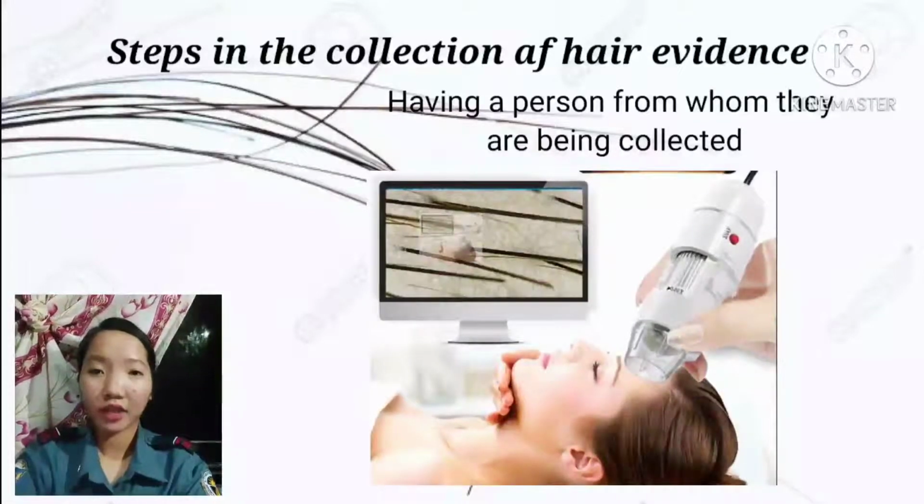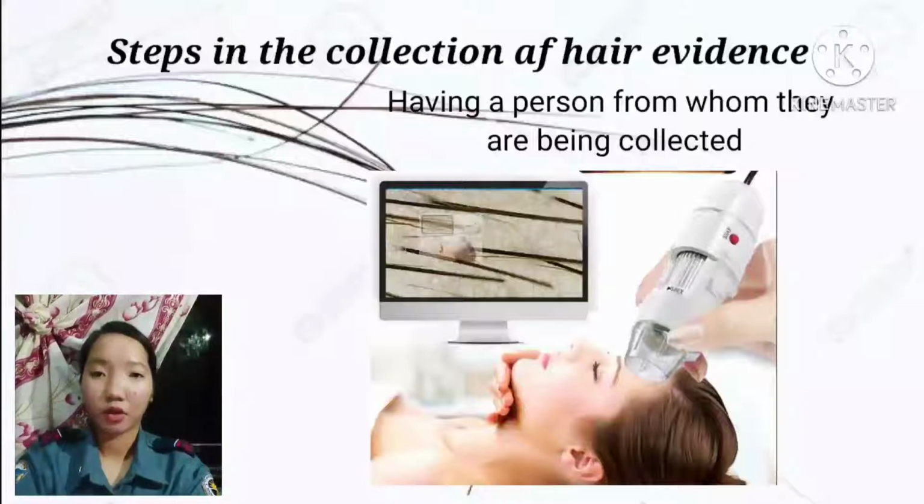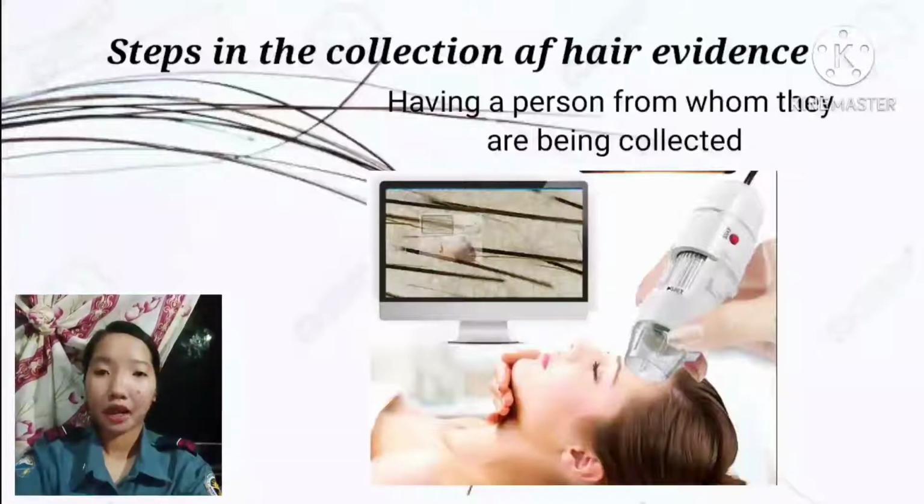First is kailangan yung person na pagkukunan ng buhok. Dapat i-bend in a clean sheet of paper and rubbing and massaging their hands through the hair para ang loose or ang mga natatanggal na buhok ay diretso sa malinis na papel.